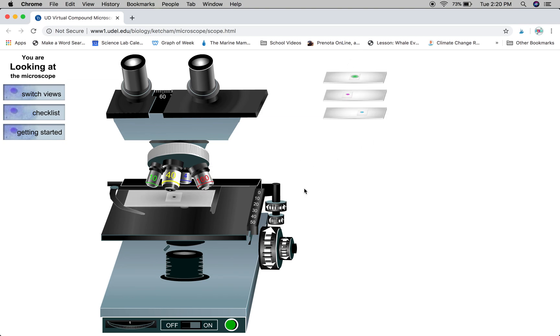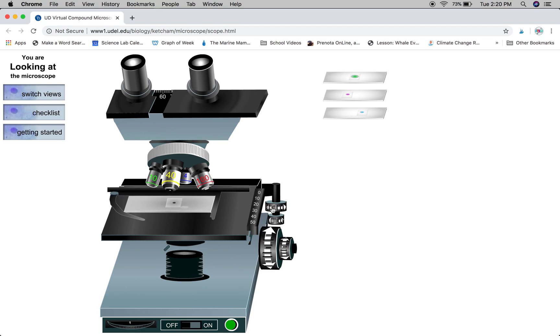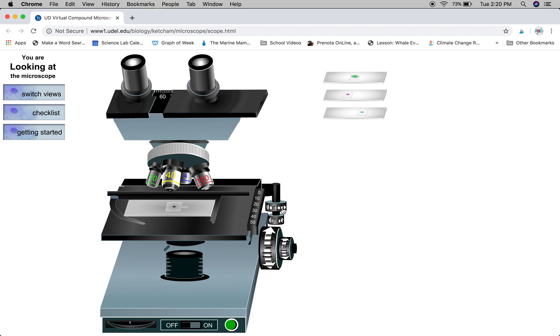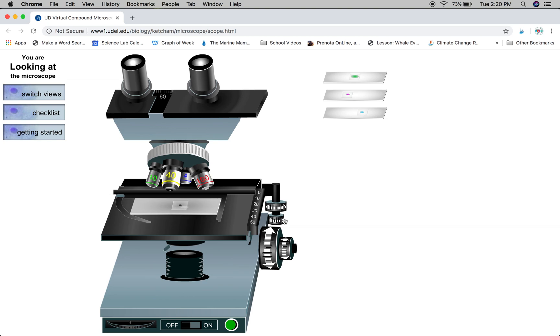Once it's on the stage, you're going to make some adjustments moving the slide forwards and backwards, left to right, to get it centered right over the hole at the center of the stage.